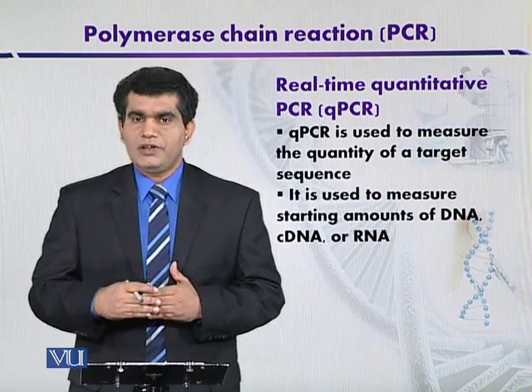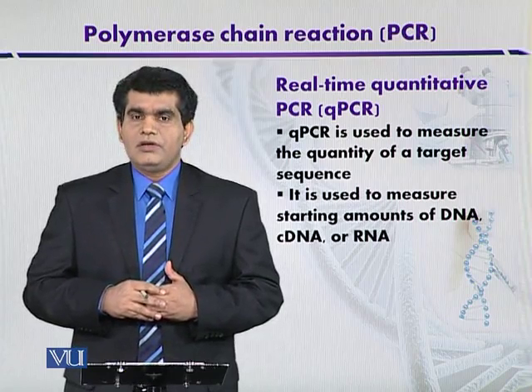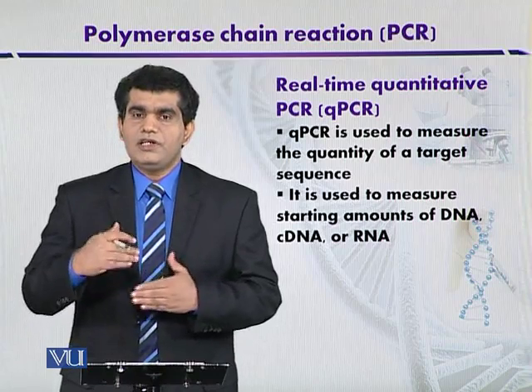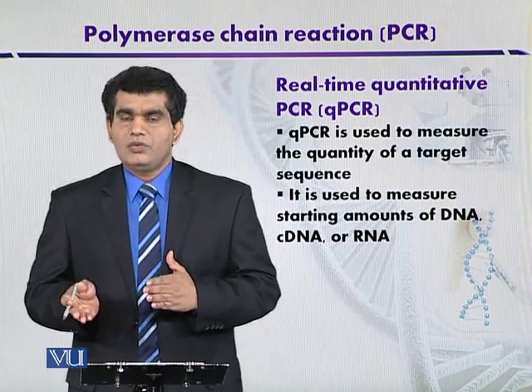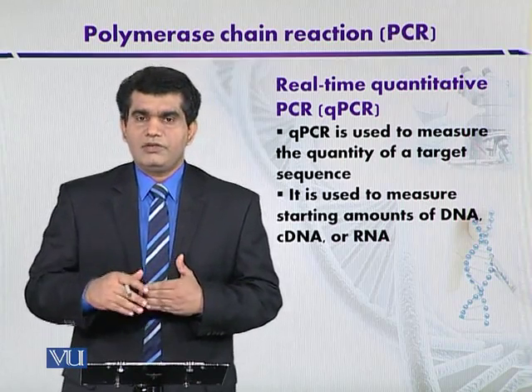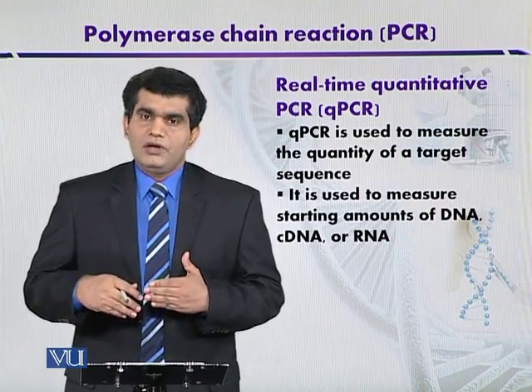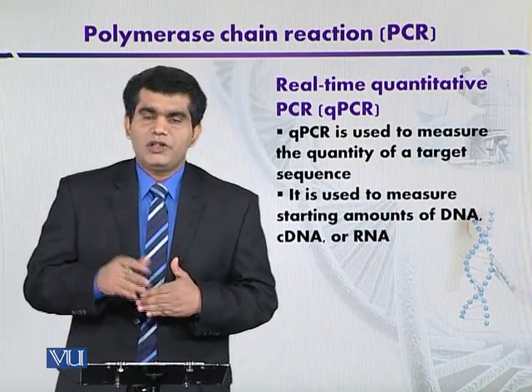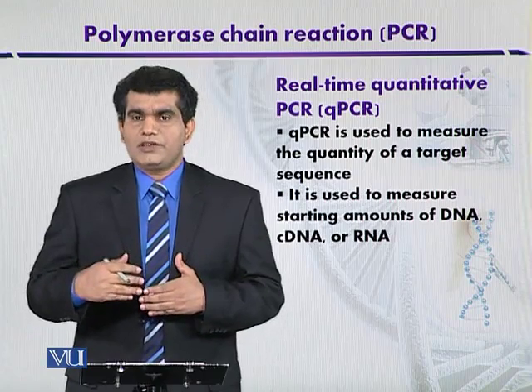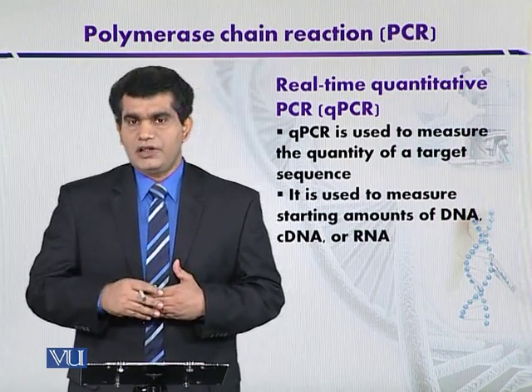ये जो ethidium bromide है ये डबल स्ट्रैंडेड डीएनए मॉलिक्यूल के साथ बाइंड करती है और जब डीएनए के फ्रेगमेंट सिंथेसाइज होते हैं आफ्टर ईच पीसीआर रिएक्शन तो इसकी बाइंडिंग भी साथ साथ इंक्रीज होती रहती है और आफ्टर ईच साइकिल ऑफ द पीसीआर जो इसकी जो एमिशन है वो भी रिकॉर्ड होती रहती है. जितनी ज़्यादा एमिशन होगी एथिडियम ब्रोमाइड की या इसकी फ्लोरेसेंस की तो उतना ही हम कह सकते हैं कि हर साइकिल के बाद डीएनए की जो कंसंट्रेशन है वो इंक्रीज कर गई है.